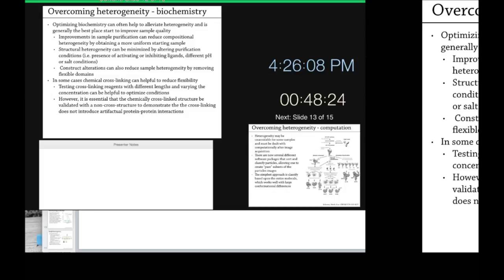No. And so other things you can do are just changing your purification, adding ligands, trying different pH, trying different salt concentration. Ligands tend to minimize heterogeneity of the sample, and so by having them in your purification throughout, sometimes that can be really helpful. Something like ATP is not really viable to have in every buffer all the way through, but maybe you can have it in one of the little tiny gel filtration columns at the end. This can help you to sometimes eliminate extra heterogeneity in the last step right before you freeze it. That way, instead of needing a liter of 5 millimolar ATP, which most of us probably can't afford, you need maybe 10 mils of 5 millimolar ATP, and that's something that's more likely to happen.